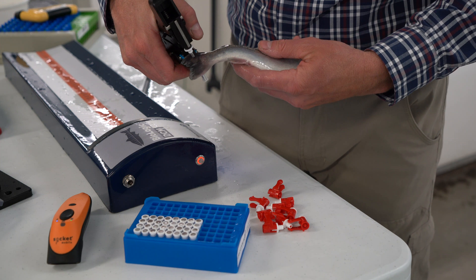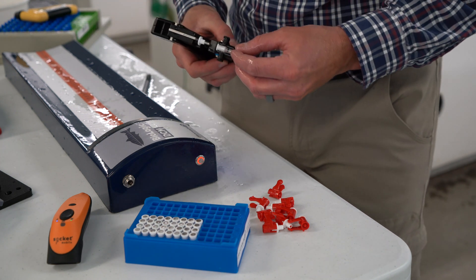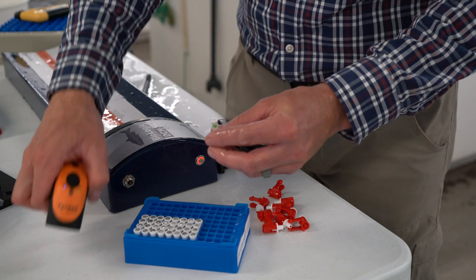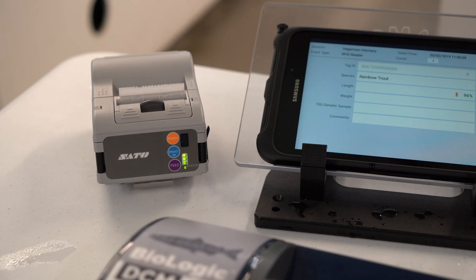Once the genetic sample has been taken, we'll scan the 2D barcode on the bottom of the vial to associate the genetic sample with the individual. And finally, we'll print some of our data fields with our label printer.